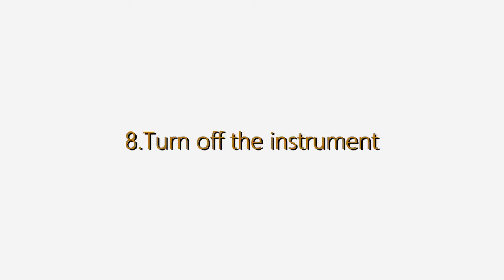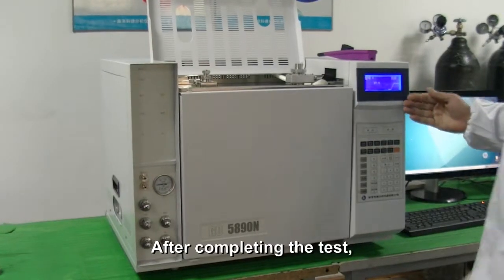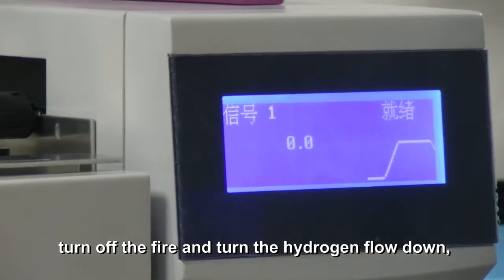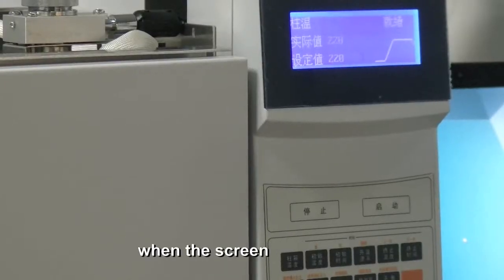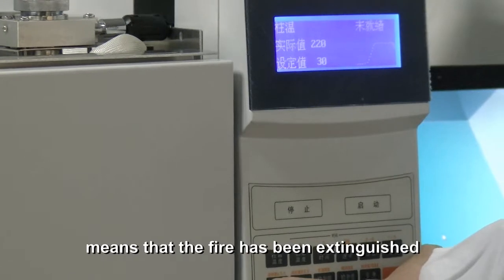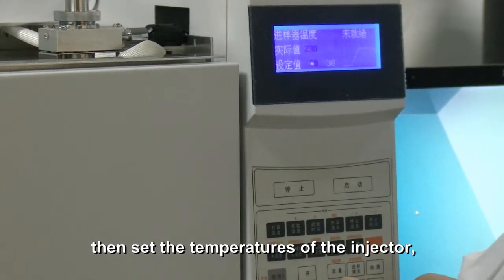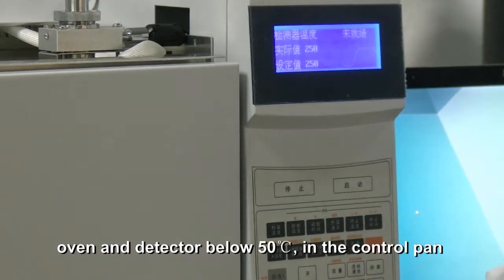Turn off the instrument. After completing the test, turn off the fire and turn the hydrogen flow down. When the screen shows zero, the fire has been extinguished. Then set the temperature of the injector, oven, and detector below 50°C in the control panel.